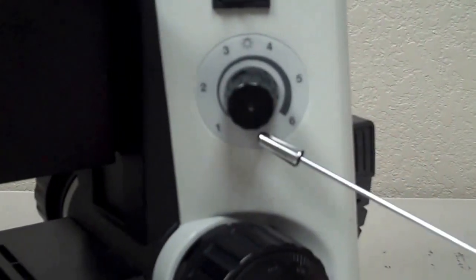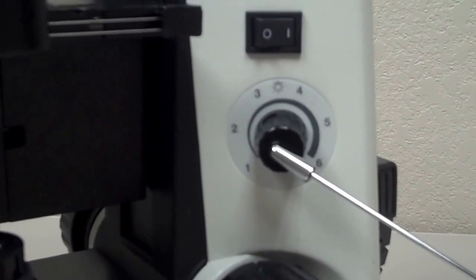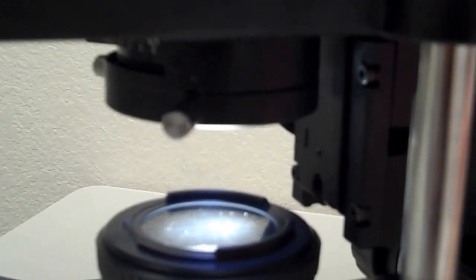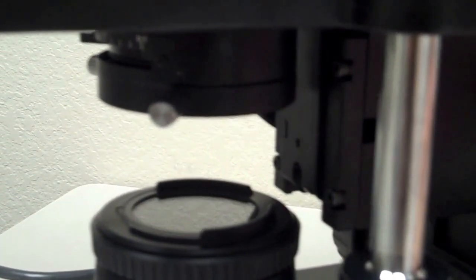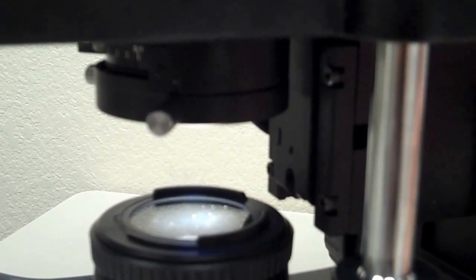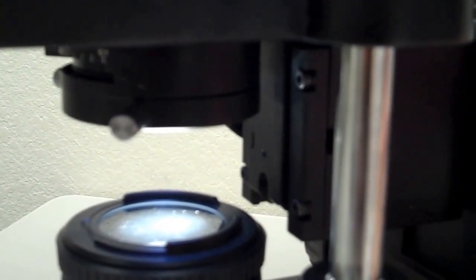The other thing that can control intensity of light is the rheostat. It's right underneath the power switch and it's like a dimmer switch for the light bulb in the microscope. Turning the rheostat knob down stops all the light from coming in. So the three things that control intensity of light are the iris diaphragm, the base diaphragm, and the rheostat.